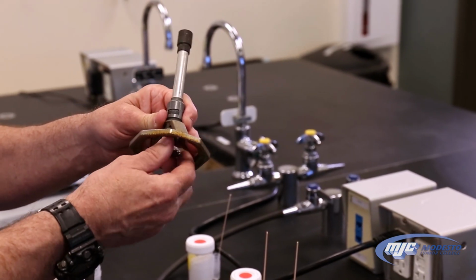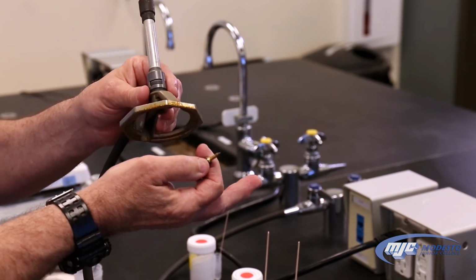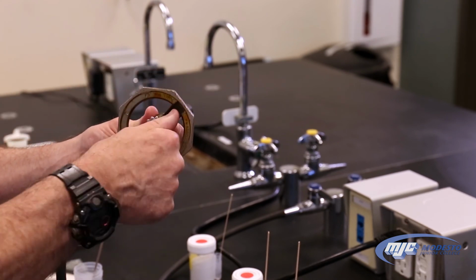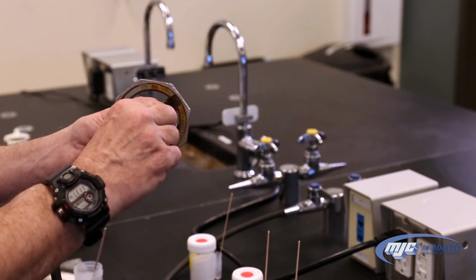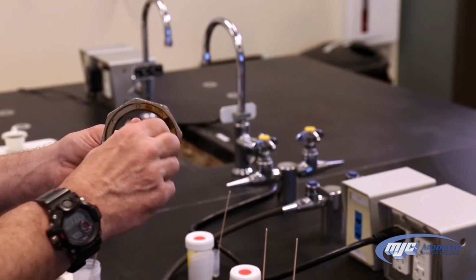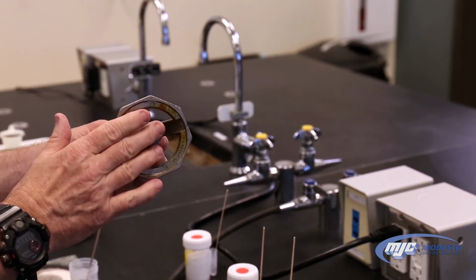And if the flame is lit and you're adjusting this and it comes out, now flames are shooting out and you can burn your hand. So to avoid that, we're going to start with that needle valve all the way in, which means there's no fuel getting to the flame, so it won't start. And we're going to back it out about 1 turn, and we'll adjust it from there.